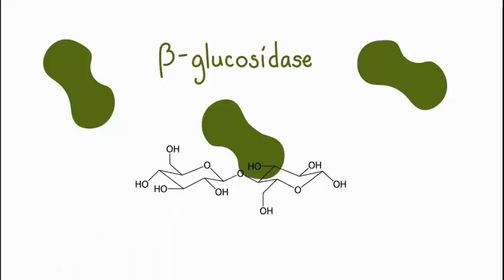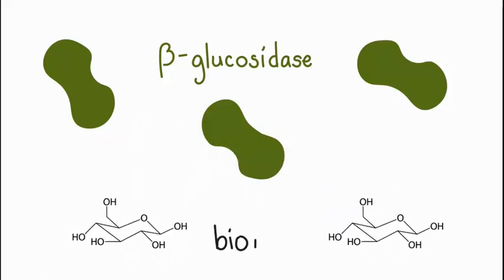And there you have it. You have successfully purified your beta-glucosidase sample. After calculating specific activity, you now know how much beta-glucosidase activity there is in your sample. So, you can tell if you have enough active purified beta-glucosidase to hydrolyze the amount of cellobiose in your reaction.